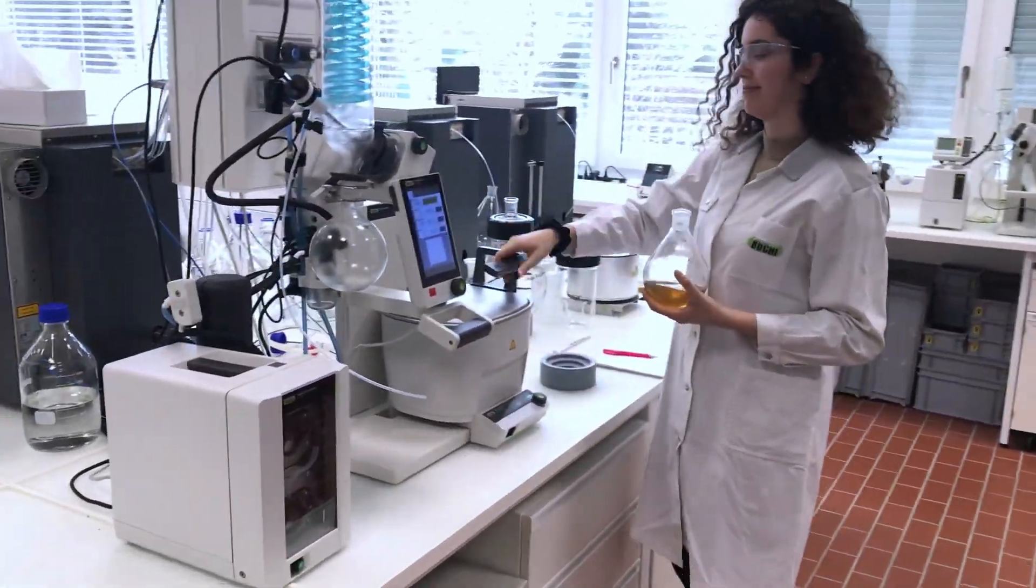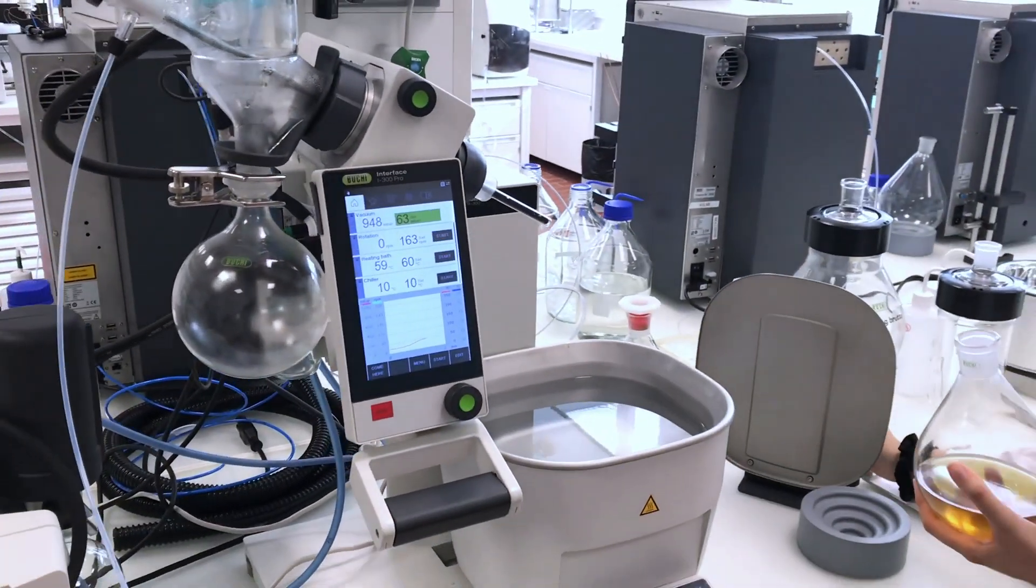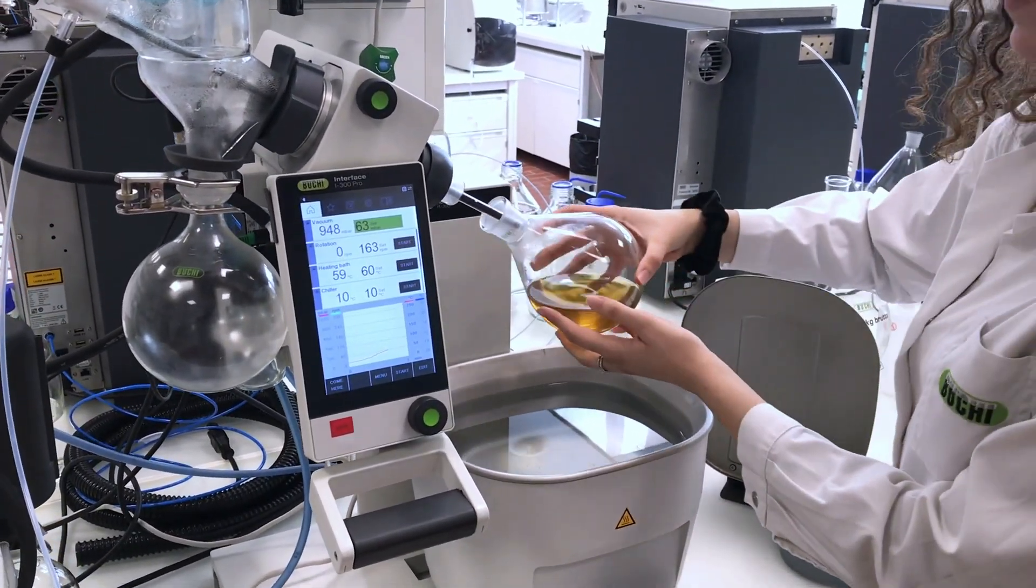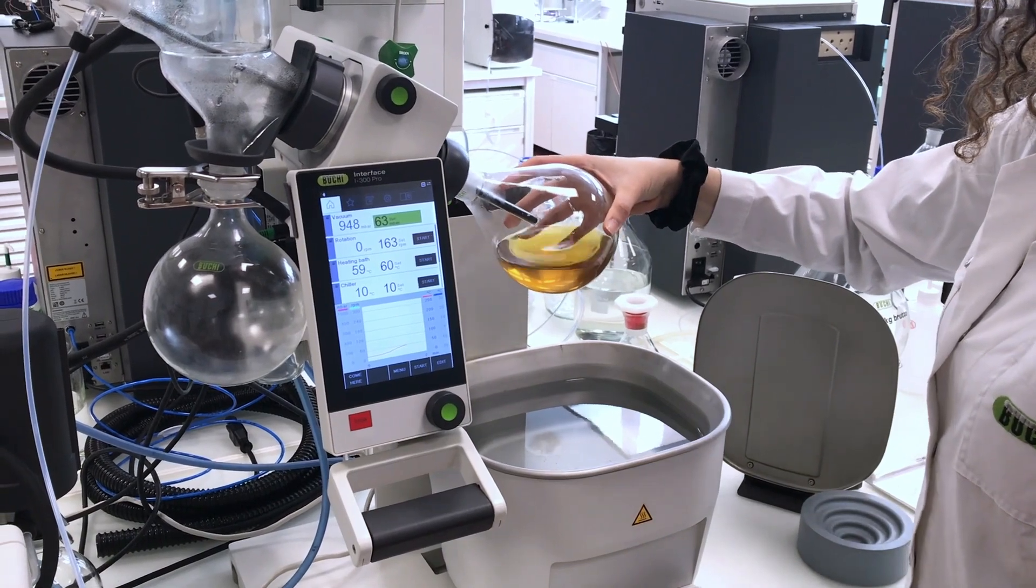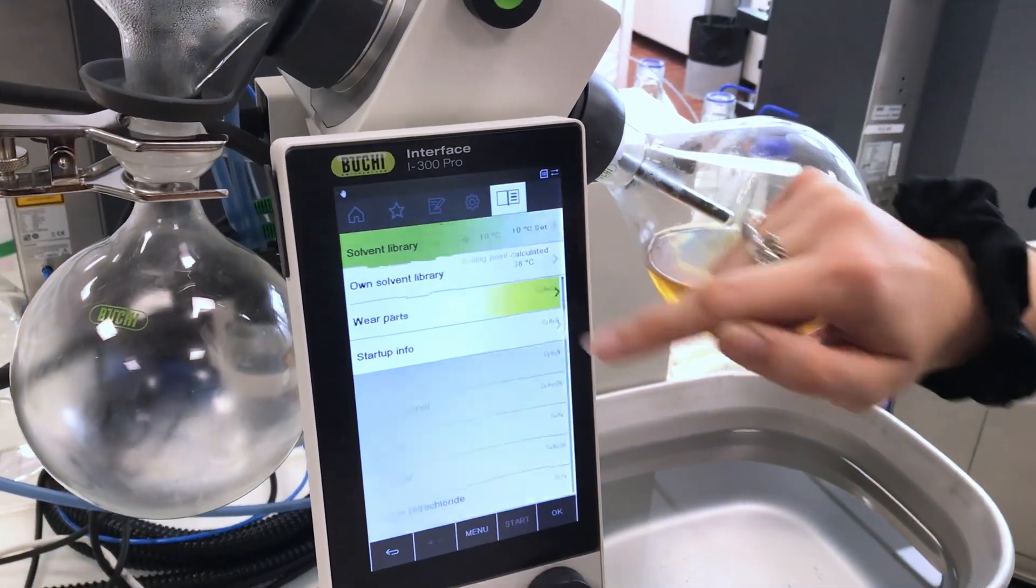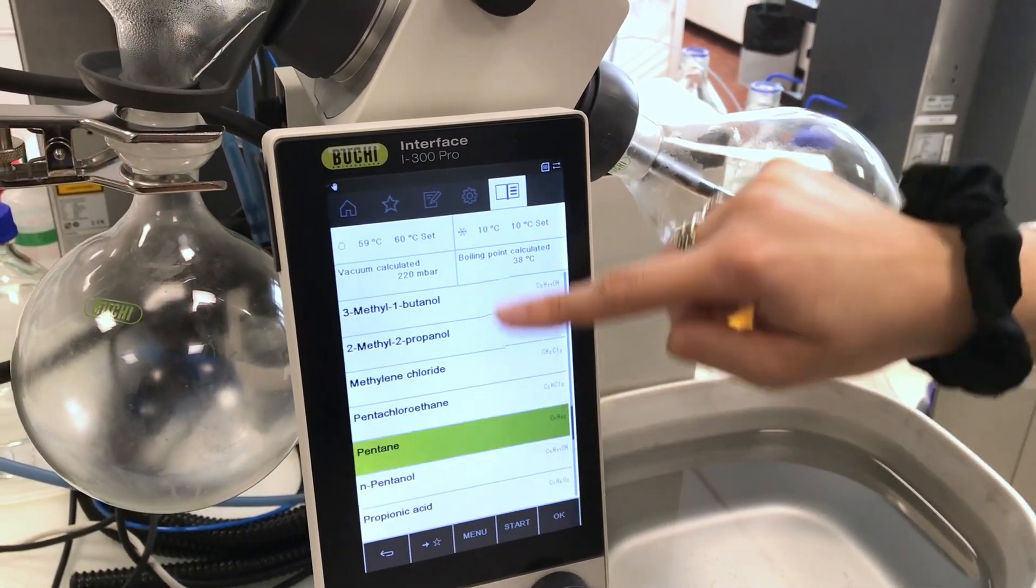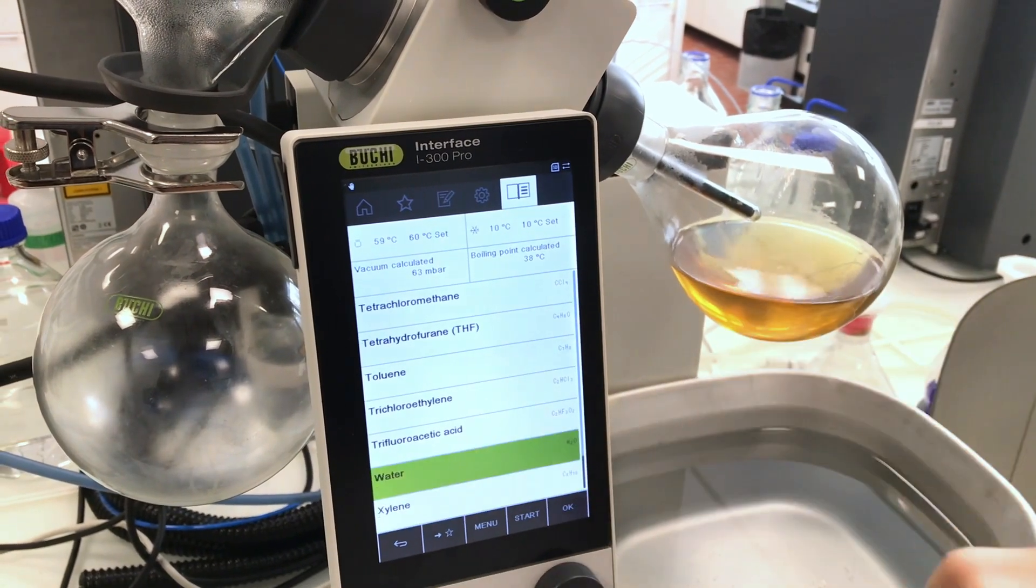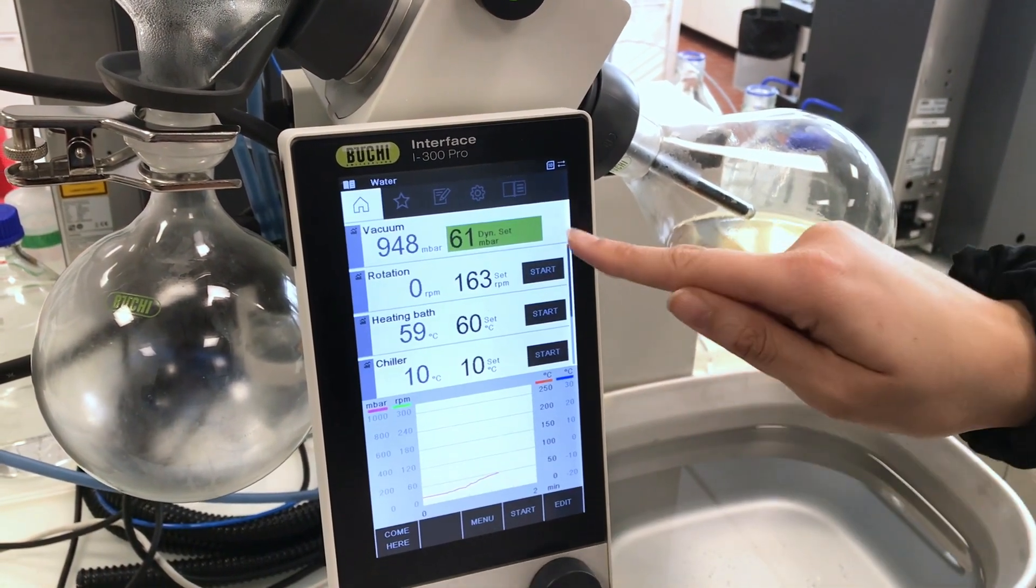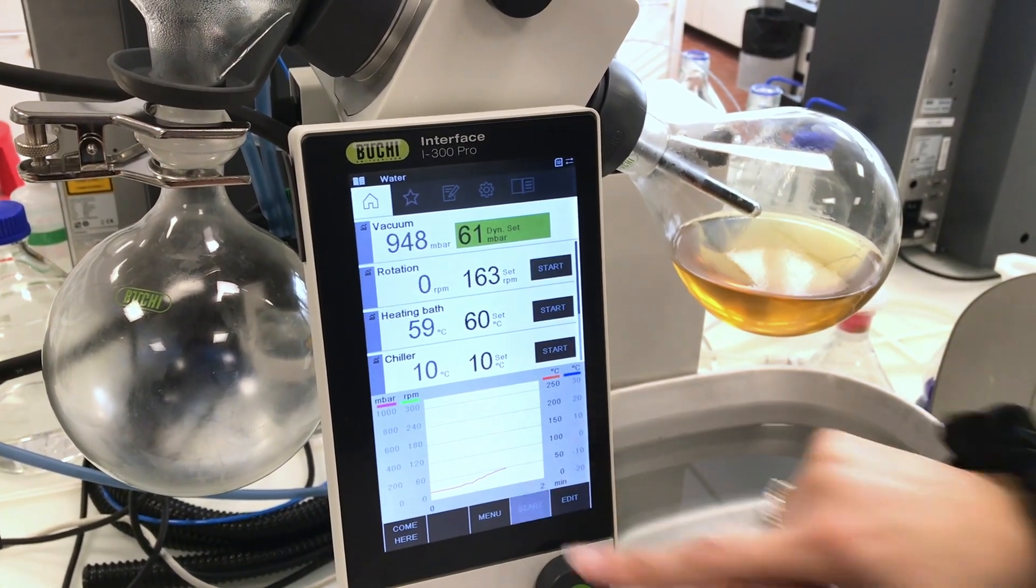So I'm taking the lid out of the bath - this helps to prevent water evaporating. I'm putting my flask there, as you can see it's quite easy handling, and I go to the solvent library. I choose water because that is the solvent that I have in my evaporating flask, and because the interface is connected to all the systems, the set pressure is connected to the heating bath temperature and the chiller's temperature.